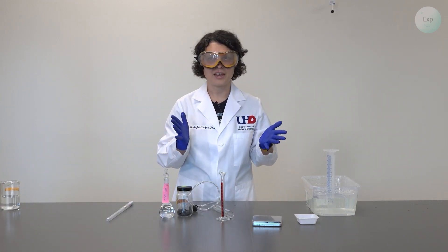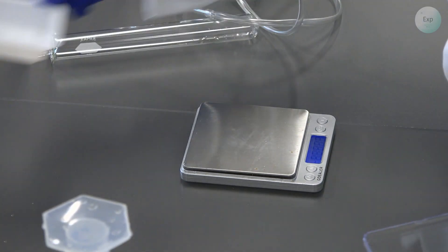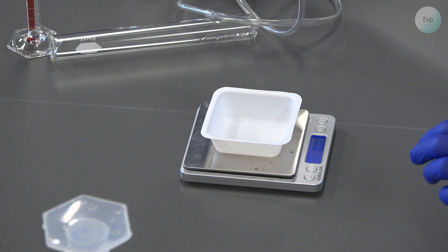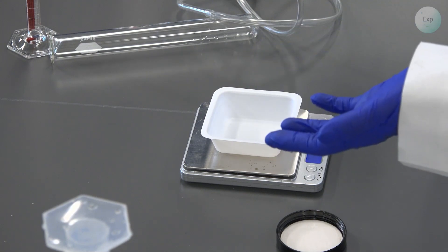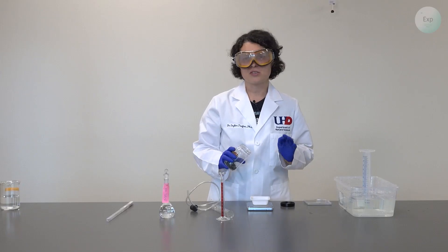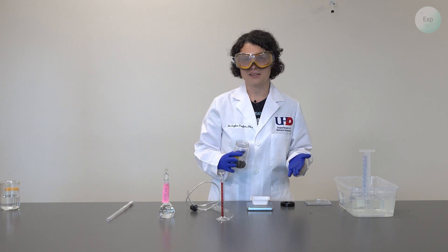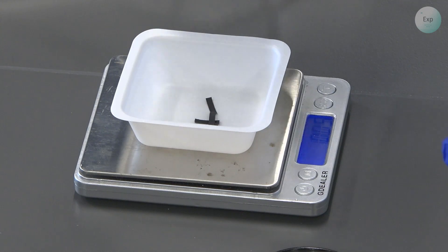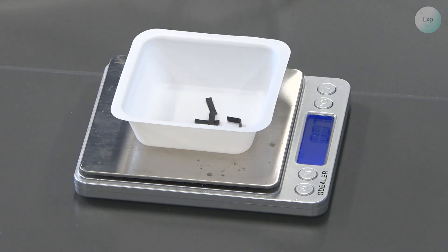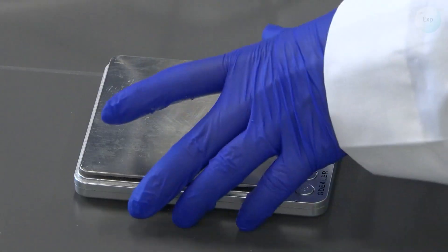For the next thing, I will need dry hands so I will wipe my gloves off. I will take my scale, remove the lid, turn it on, place the weighing boat on top of it, press tare, and then I will measure out between 0.06 and 0.08 grams of magnesium ribbon. It is best to err on the side of less rather than more. If you have an analytical balance that gives you more decimal places, please use that one. I measured out 0.07 grams of magnesium ribbon.